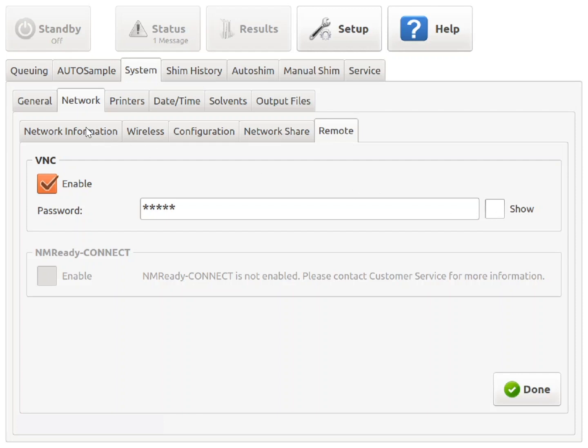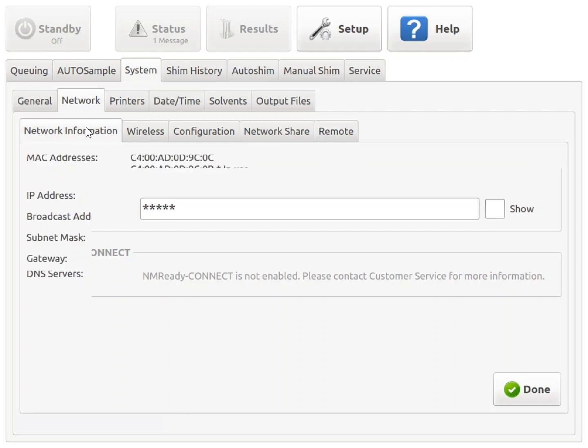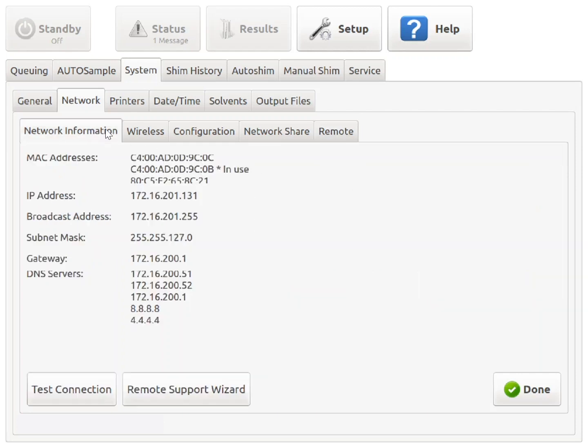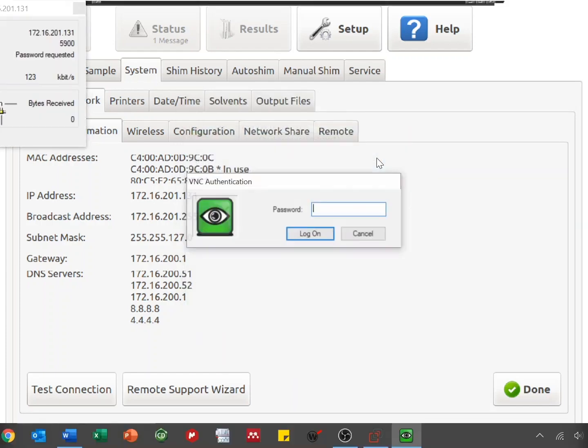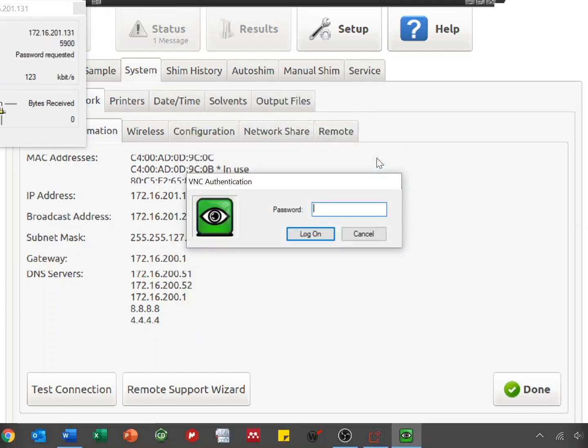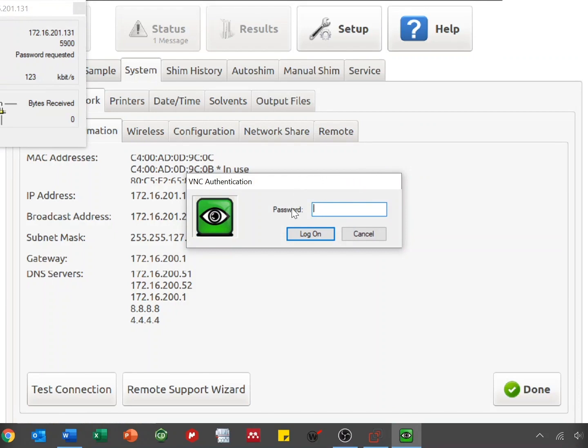From this screen, navigate to the Network Information tab and write down the instrument's IP address. From the computer, open UltraVNC and enter the instrument's IP address as the host in this box up here. Click on the Connect button and enter the password you selected earlier for the instrument when it prompts you.